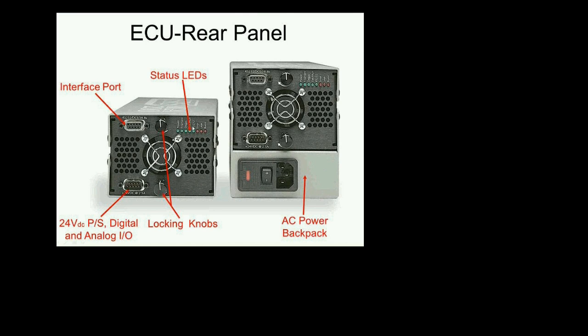So what we'll do is we'll put dental mirrors so we can actually see the LEDs. This information here is critical. The operator at the factory is constantly looking at the LEDs to say, is my filament still on? Can I vent the system now? Is it safe? Do I need to go turn the filament off? Did I have an error? Is my power on? And so on. So I'm a big fan of status LEDs if you can have them.